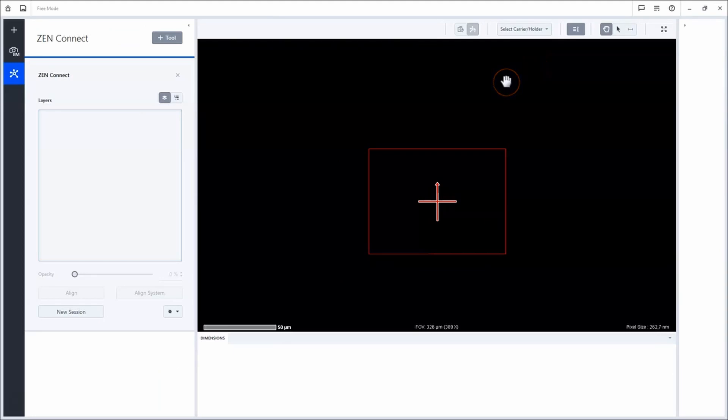Let's start to fill the project with image data. To do so, you simply need to move to the acquisition tab.